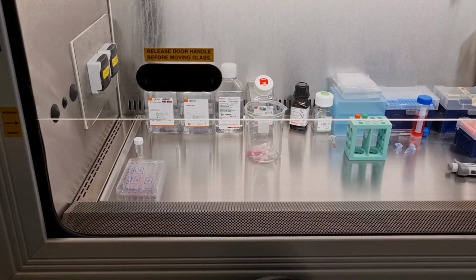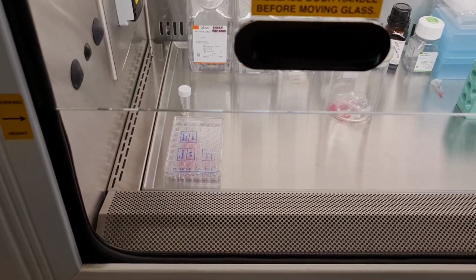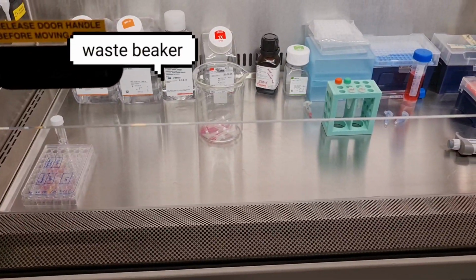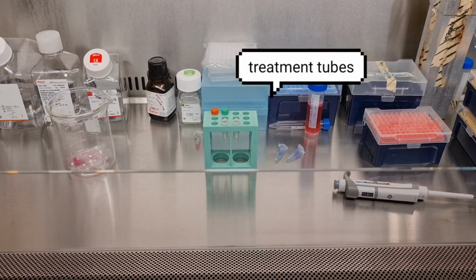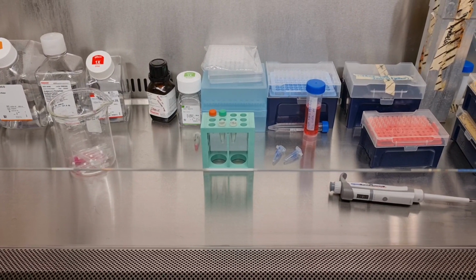Doing some cell treatment and also transfection using Lipofectamine. So there I have my 48 well plate that has some cells seeded in it. That's a waste beaker, and now those are some tubes that I need to combine for my transfection experiment, and I'm just letting it incubate for a couple of minutes.